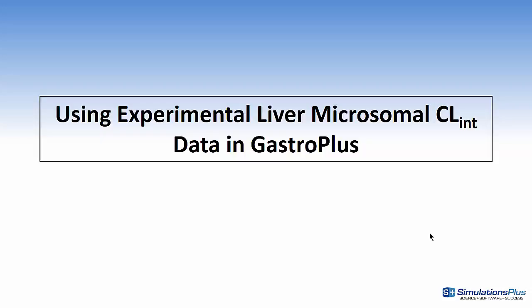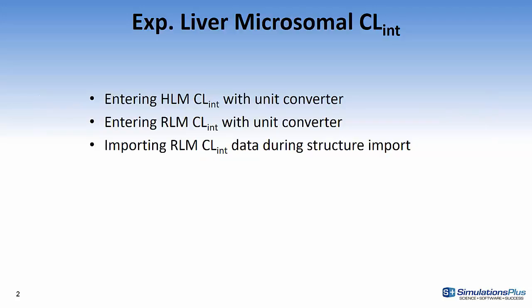Hi, this is Mike Lawless, and in this video I'm going to show how to incorporate experimental liver microsomal clearance data into GastroPlus simulations. I'm just going to give three simple examples.